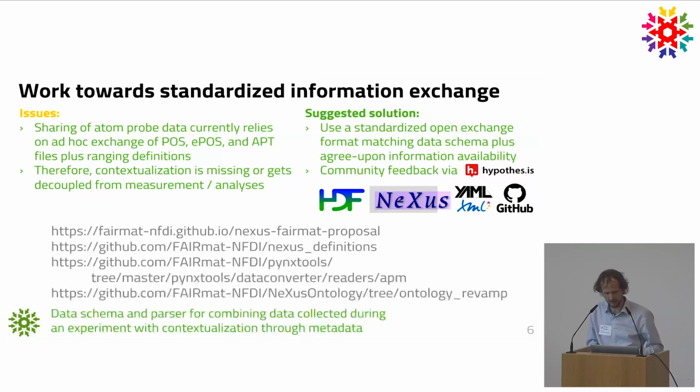Also, we have all of this open, and in fact, it's already all open, but there's not much publication on this, honestly, which is quite a misfit. However, this modeling with NeXus is primarily, you could call it, the data schema, but thanks to the work from Shajil and Chandra, and also the team, that is now also available as an OWL file, because there's a converter that interconverts automatically from NeXus to OWL. So basically, yes, that is building an ontology for atom probe tomography.